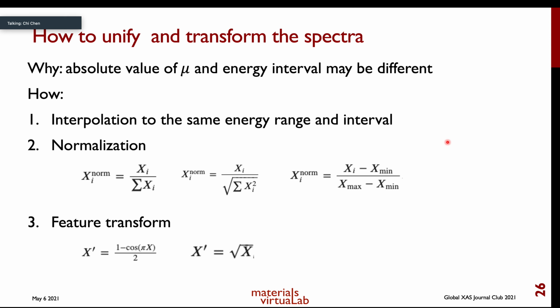We also encountered an issue with respect to processing experimental data. We know that experimental data may have a different energy range. They may be sampled on a different energy grid.